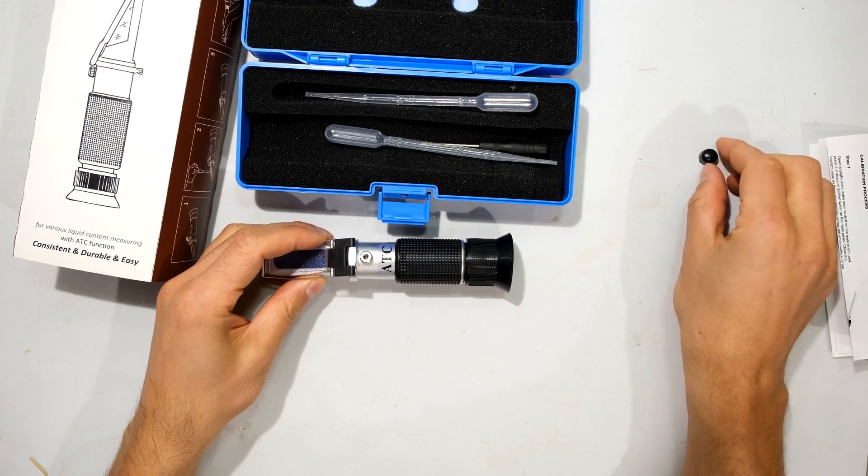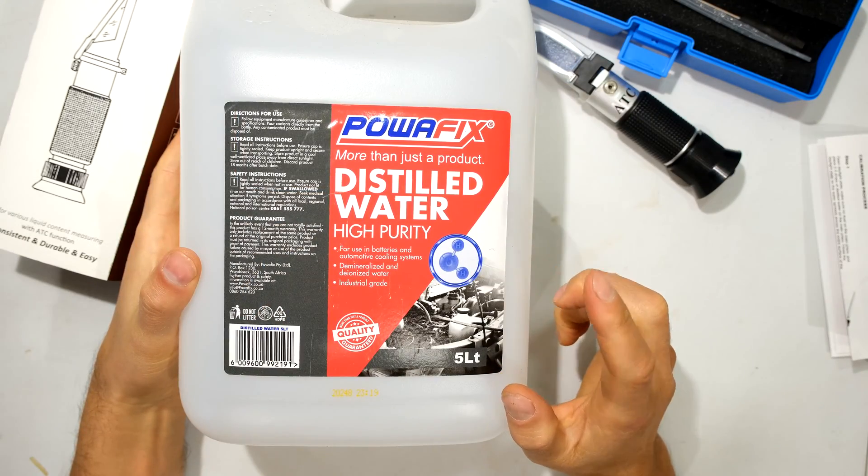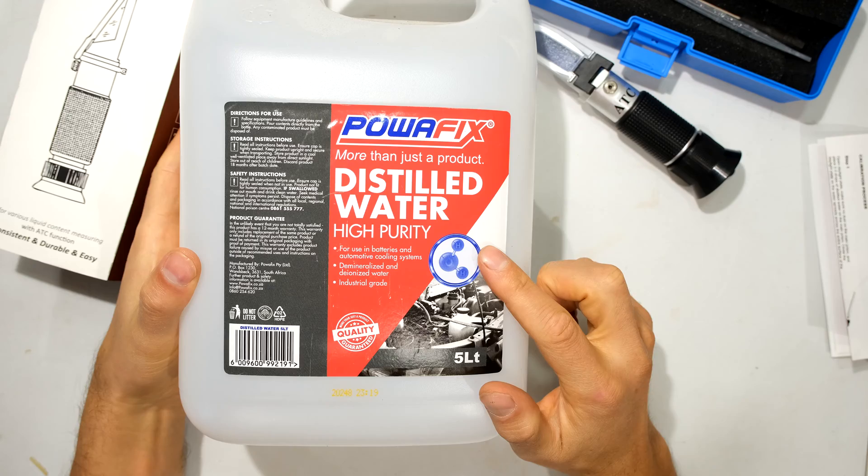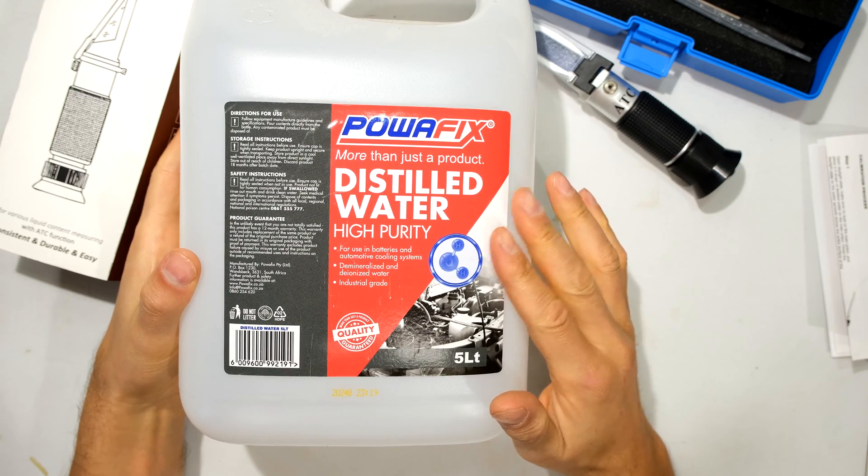So I just pull that open. Now, in order to do the calibration, you will need some distilled water. So here's the distilled water.